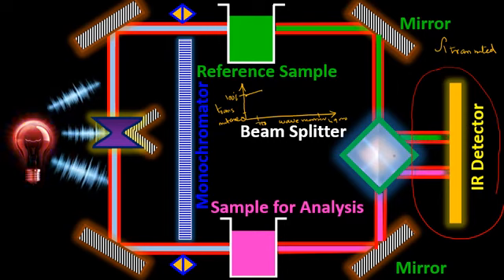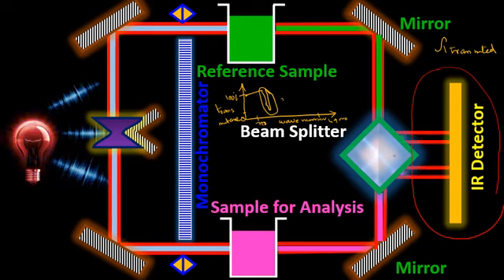However, when the infrared radiation is absorbed by some chemical, the percentage transmission will decrease, and in this way the absorption region will appear. If at another wavelength the infrared radiation is not absorbed, then the transmission will be 100%.